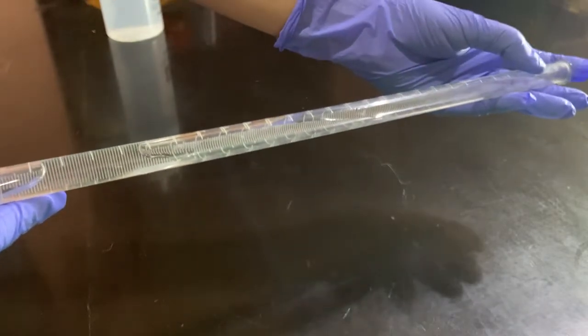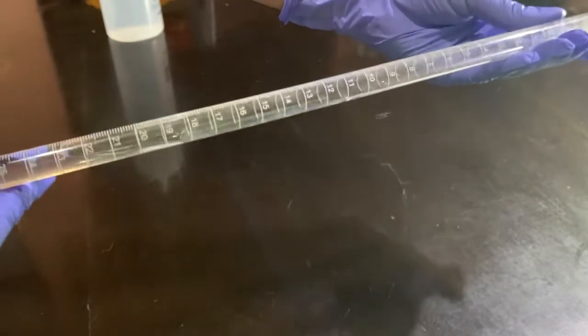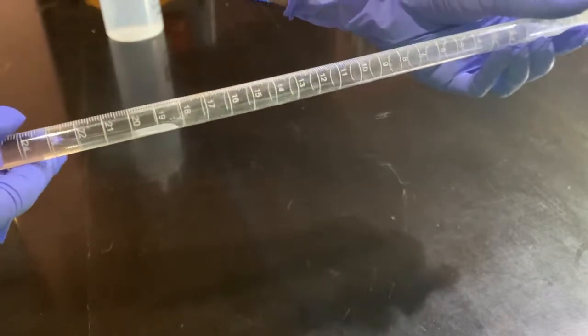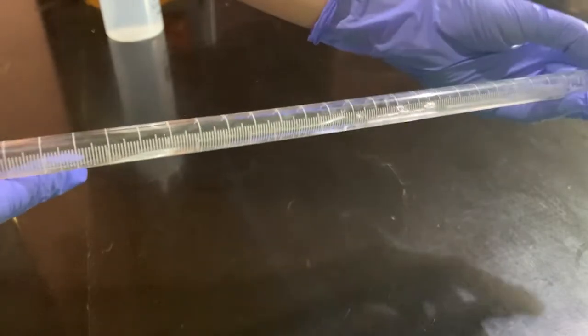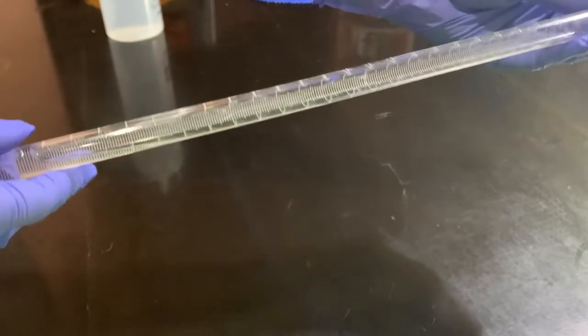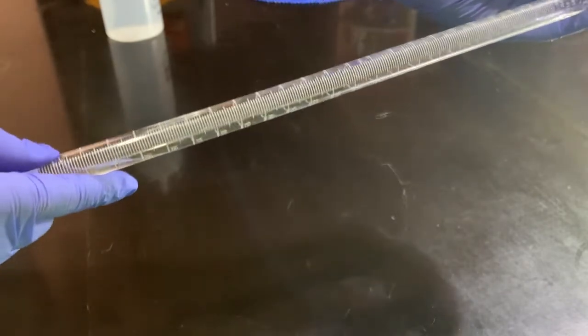After 5 to 10 seconds of doing this, we will let the rinsing water drain into our waste container and then repeat this process with small volumes of deionized water. Next, use the solution for rinsing, identical to the cleaning process.